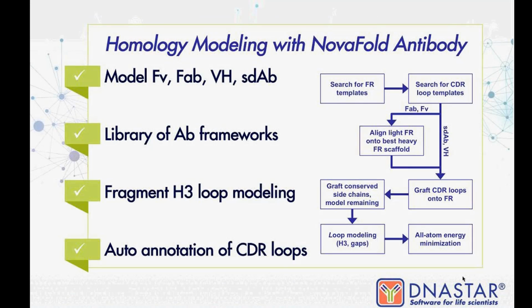Moving on to NovaFold Antibody. This is a little bit different than NovaFold. NovaFold is a very computationally intense program. Structure predictions can take up to 10 to 20 hours just due to the semi-de novo approach to the modeling. NovaFold Antibody is strictly a homology modeling program where it takes advantage of a library of antibody frameworks for the constant regions in order to model Fabs or heavy chains or single domain antibodies.